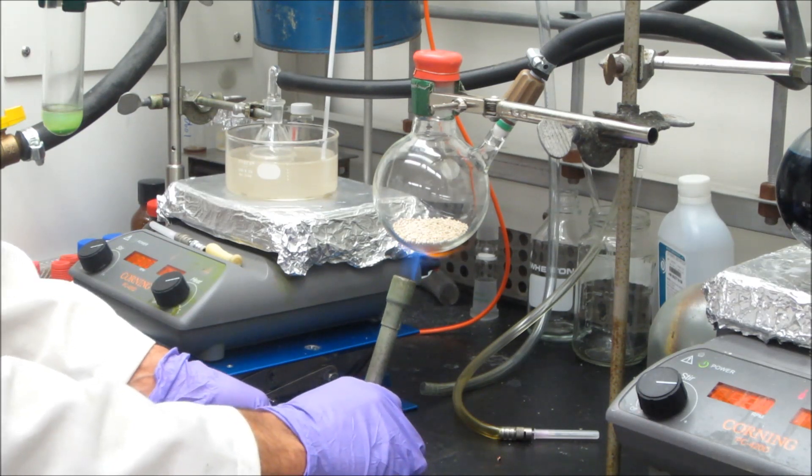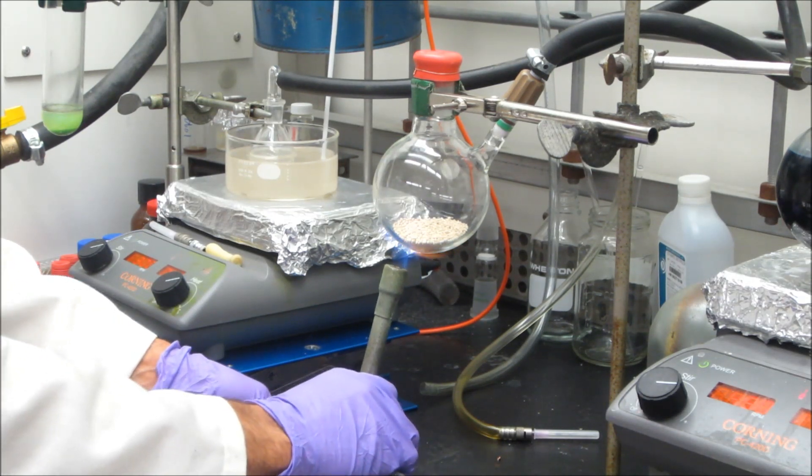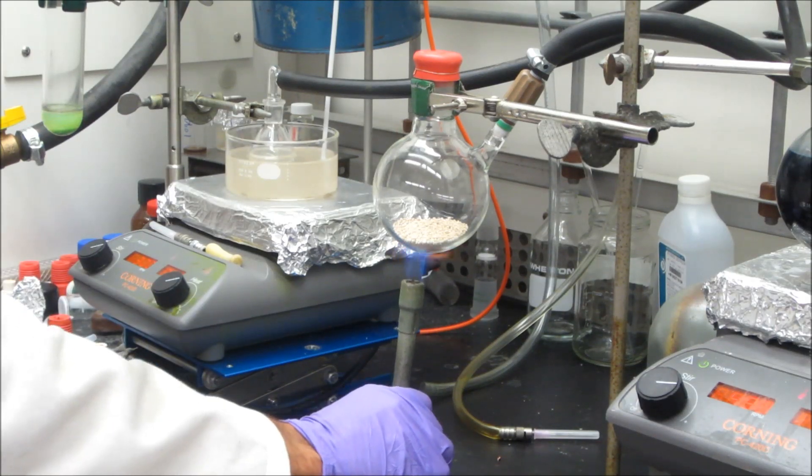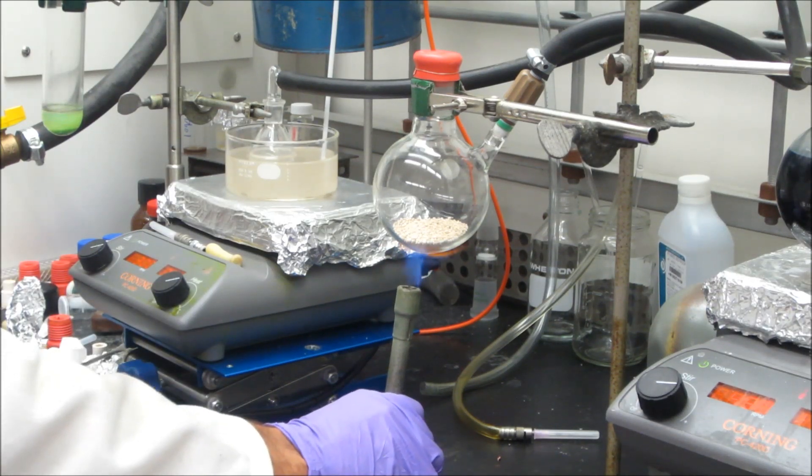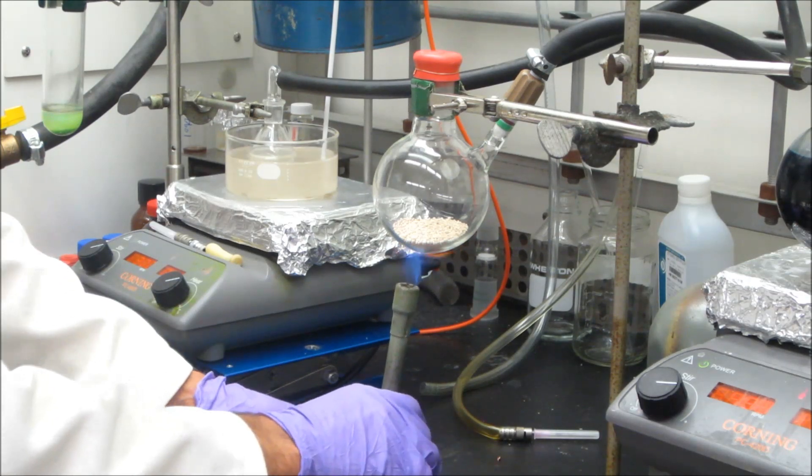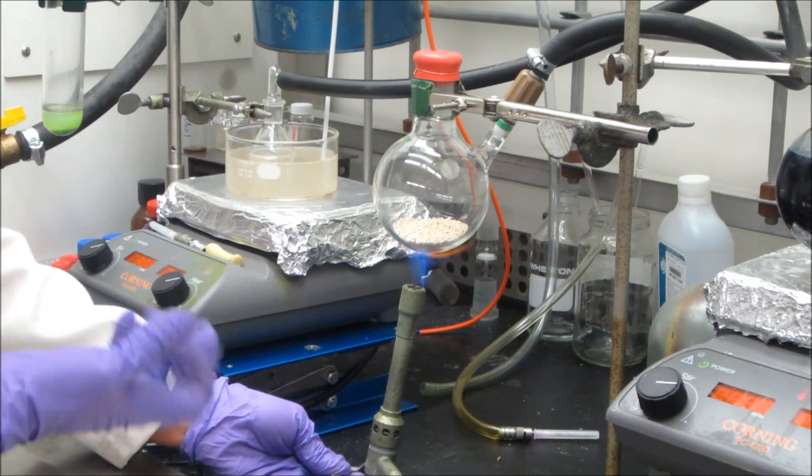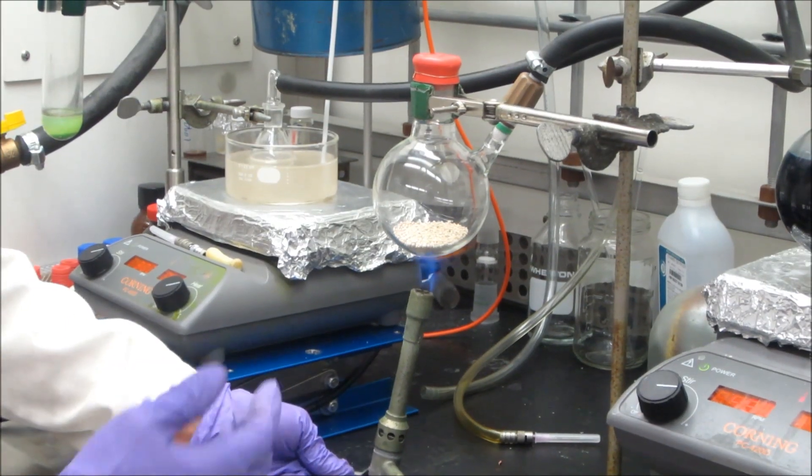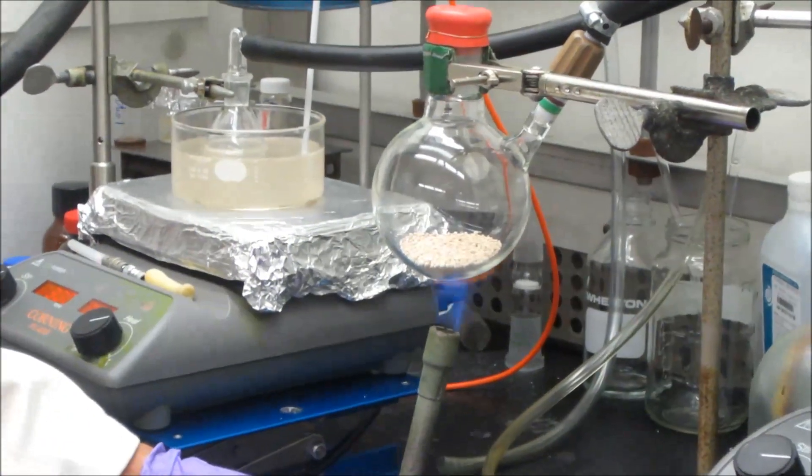So the flask is under nitrogen, not under vacuum right now. Correct. You don't ever want to heat a flask with a Bunsen burner while it's under vacuum because that could lead to a dangerous situation. The flame basically heats the glass, it weakens it, and if you've got it under vacuum, you could have an implosion or the glass itself will get deformed.